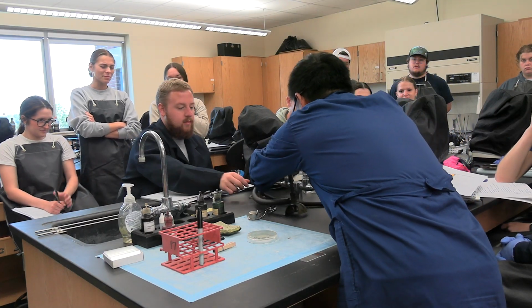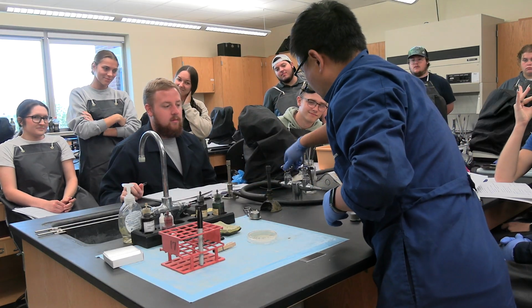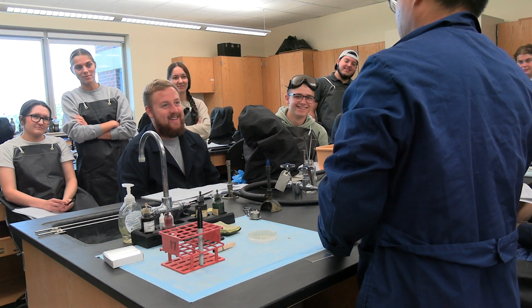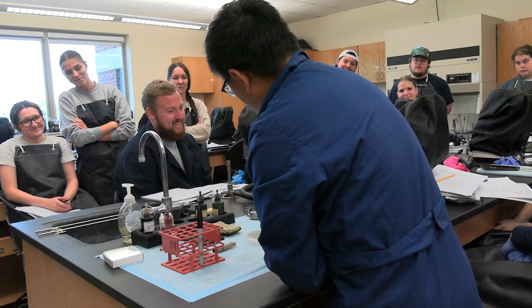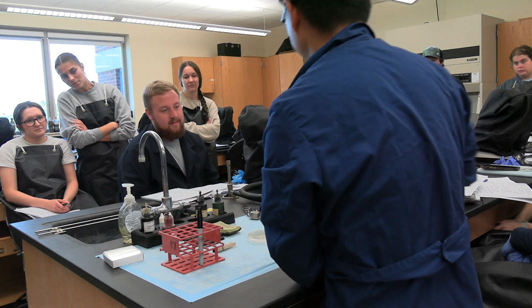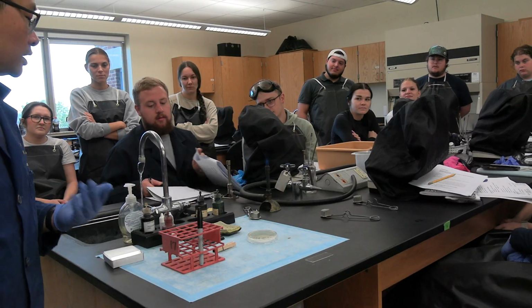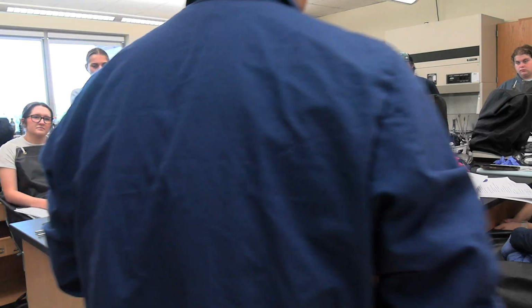Here we go this way. Look at that. It looks like a locket. That's the fire. At the bottom, you can adjust it, huge or small. You don't need it too huge. The second thing we want to check is that the water is working. Sometimes the water doesn't work. At least it's dripping. That's too much. A little bit is fine as long as it's dripping.